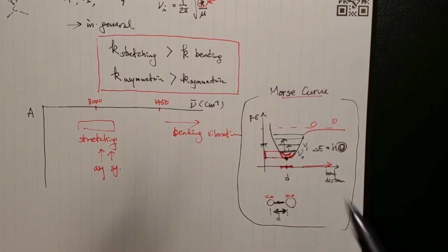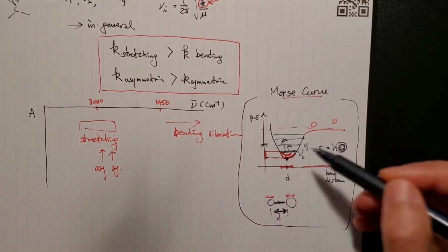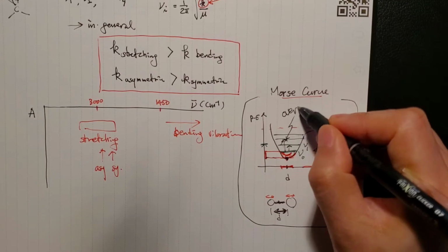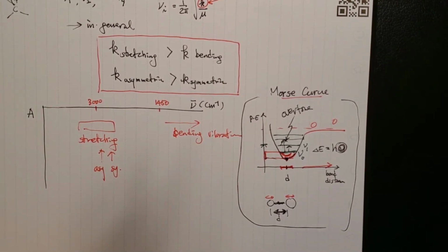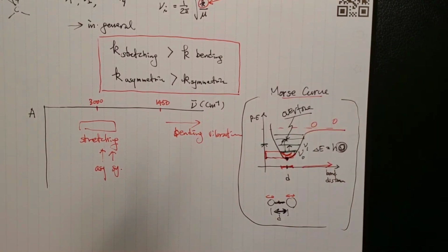It's supposed to be used for another stronger vibration, but this weaker vibration happened to absorb it, and it went up twice. So this one right here is called overtone. You actually see the signal that's twice this frequency on the IR. So you need to know that when you read the spectrum, there is some signal that does not quite match the structure you are presuming. Then you have to consider the option that you may have an overtone.